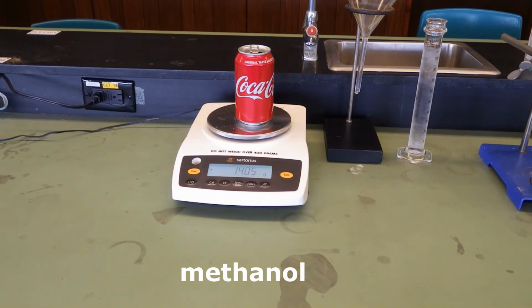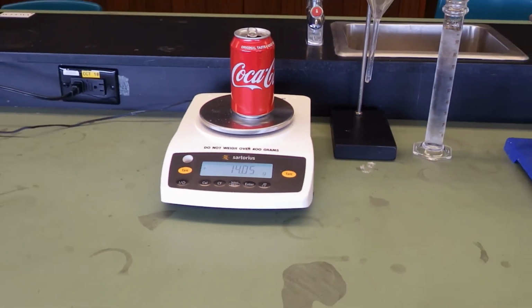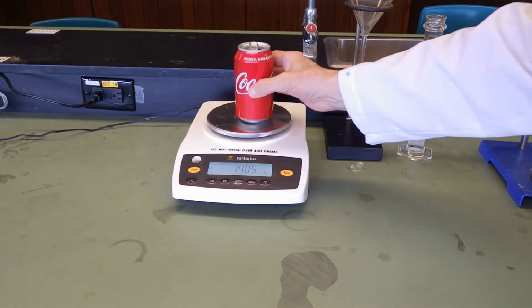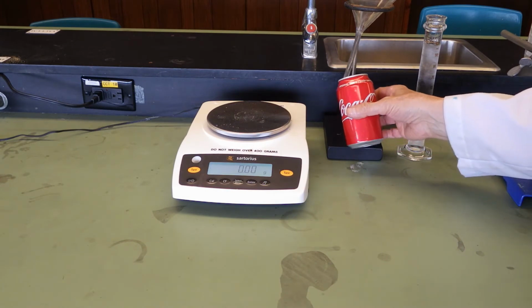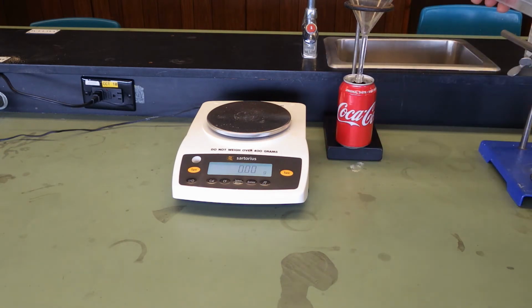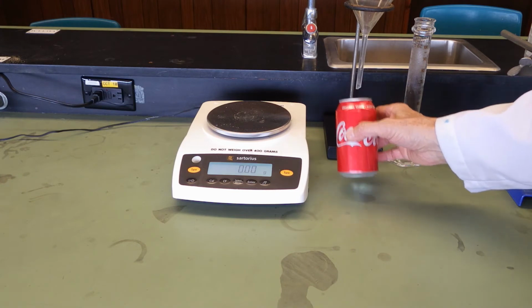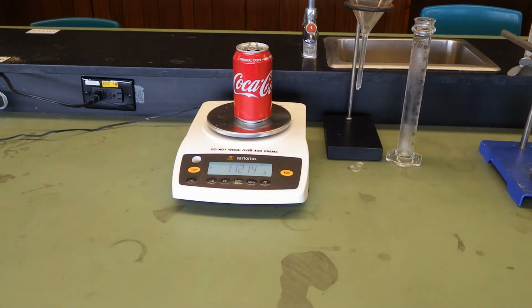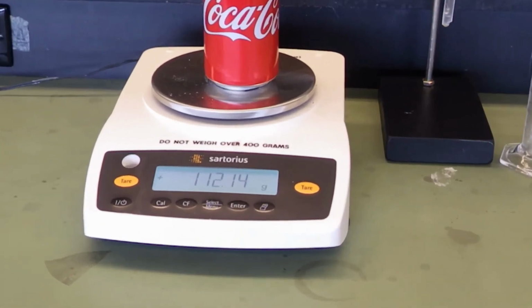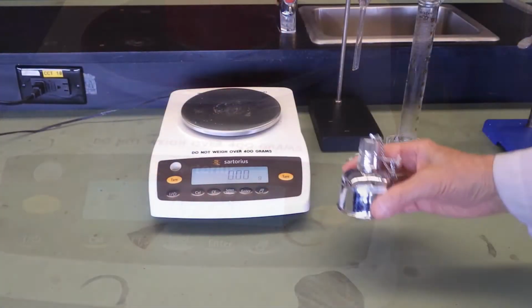We'll get the weight of the aluminum can. You need to record this: 14.05 grams. We'll add 100 mL of cold water and weigh to get the total mass. You can subtract the weight of the can from the total mass to get the mass of water: 100.14 grams.